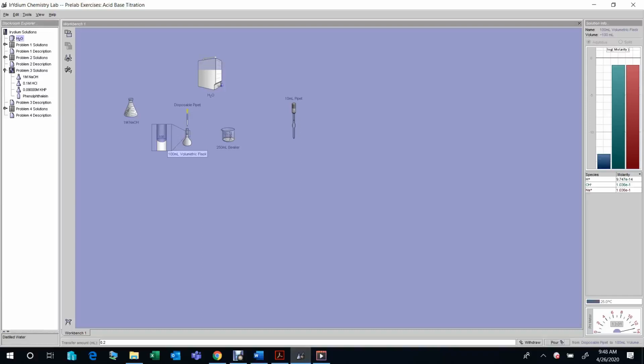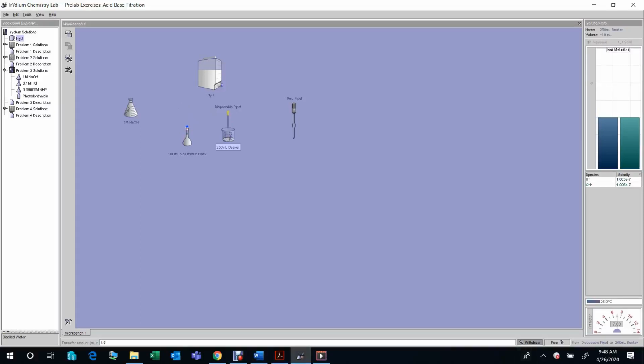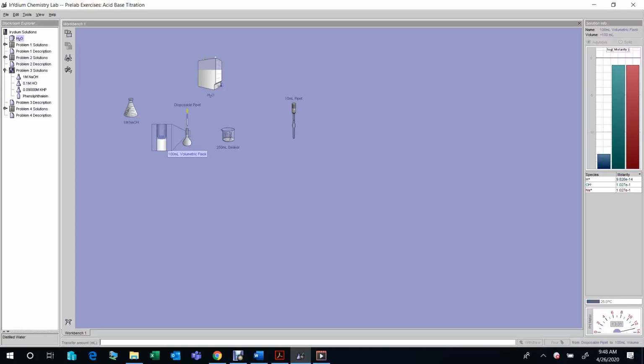Pour. Okay, you see the bottom of this water level is exactly above, maybe still need 0.1. Let's try. Okay, I get 1.0, withdraw, and then I can add 0.1. Let's see, 0.1 milliliter. So pour, you see, okay, then maybe pour another 0.1. Good.